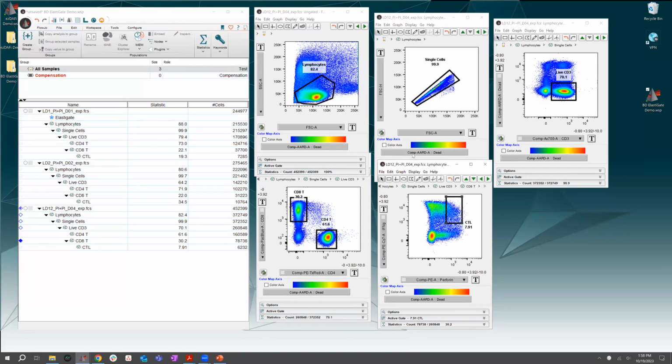But no matter what the placement looks like, at the end, you still get what appears to be a user defined gate. I can still come in and make adjustments. I can move the gate however I'd like to. So all the resultant gates are still adjustable.